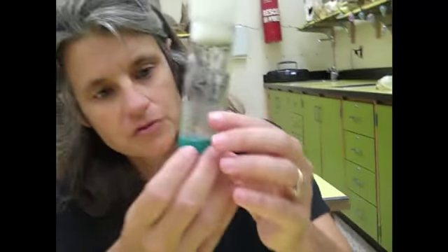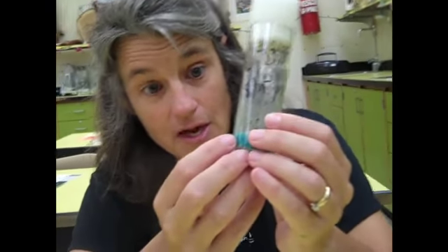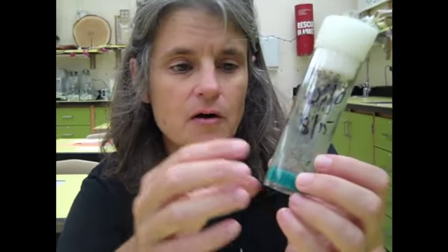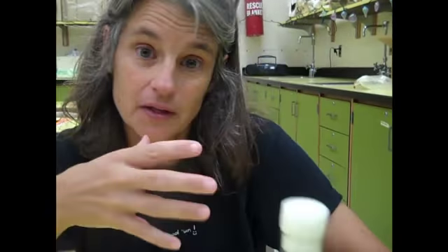Okay, the purpose of this little clip is to show you guys how to work with the fruit flies. You would get a culture that looks like this. It's labeled with what's in here and the date that it was put in. The blue stuff at the bottom is their food. It is just starch with some stuff in there to prevent fungus from growing, but if they fall into it when they are disabled, which we're going to do to them in a minute, they can't get out of it. So it's really important that we not let them fall into that blue gooey stuff.